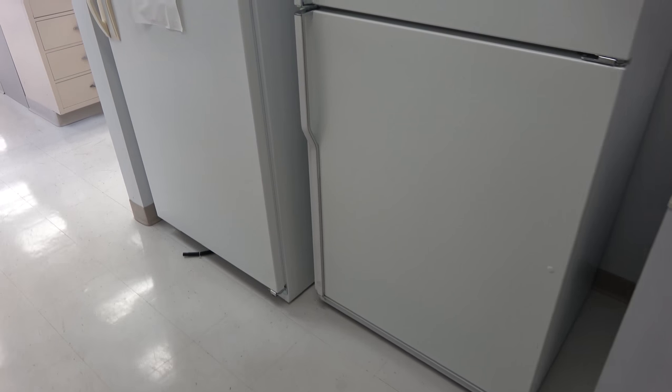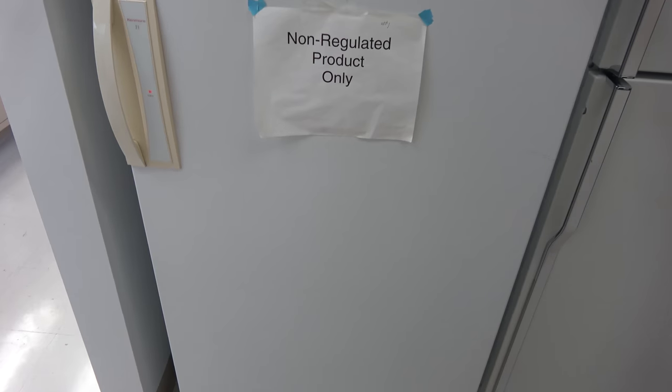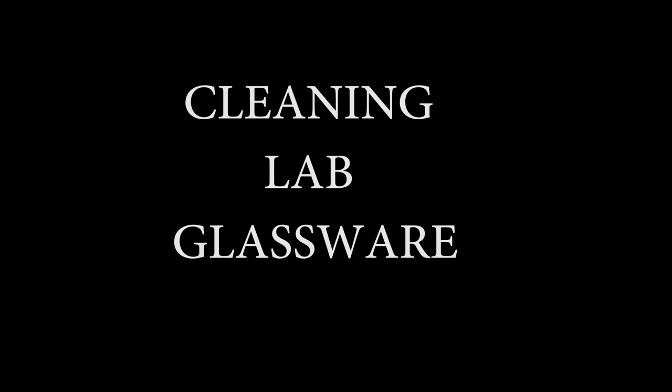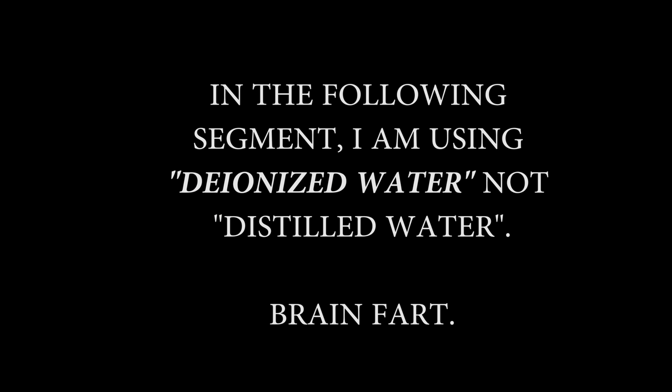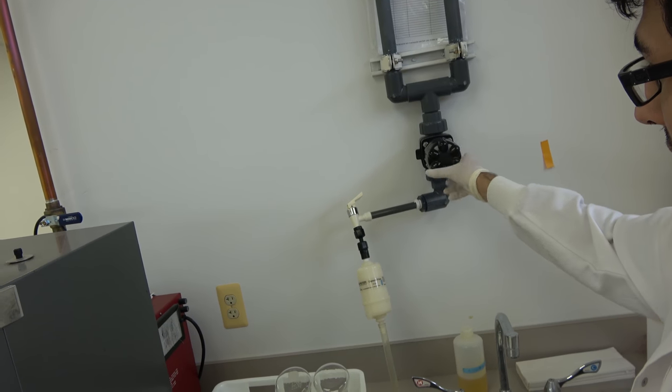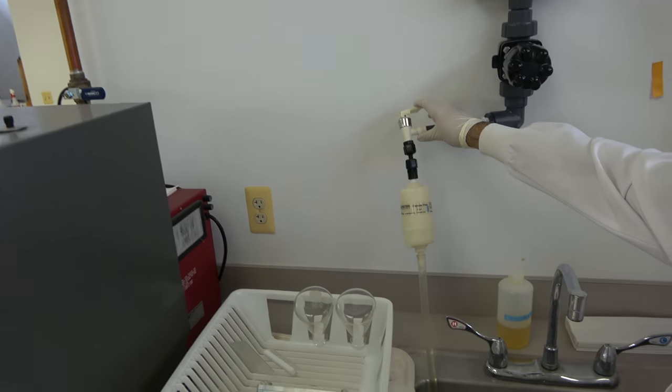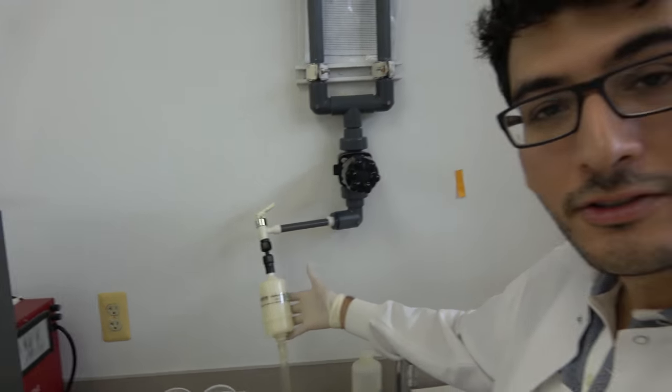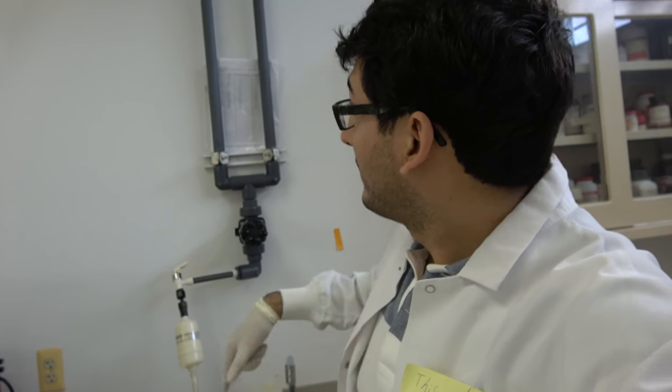And of course we have refrigerators and freezers. Now, just like the microwave, please don't store any food or drink in here. This is not to put your fucking hot pockets, anything like that. Now, before I actually show you how to clean lab glassware, I need to talk about distilled water. Distilled water comes from a tap that normally looks like this. You turn it to the side, and then the water comes out. A lot of labs like to add little extra doodads, little extra filters, whatever. DI water tap is very special. It's highly pressurized. It goes through this whole system. It's sterilized with UV radiation and all these fucking things, whatever.